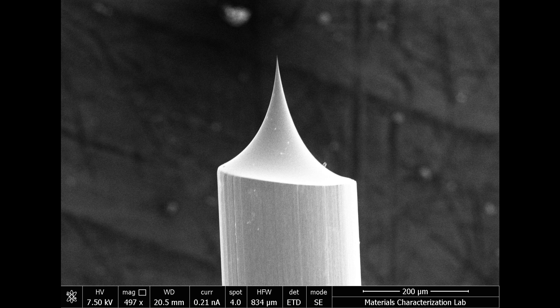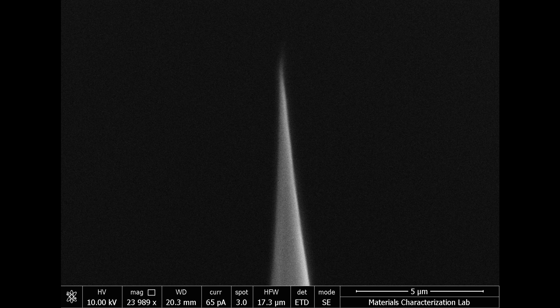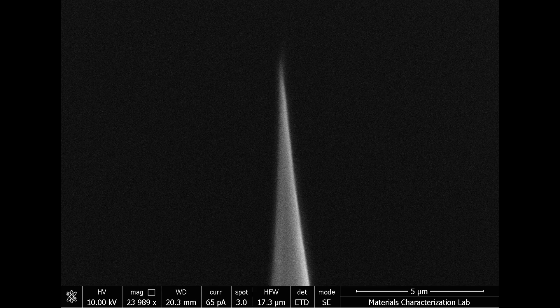I was not able to measure the radius of the tips due to the limitations of the SEM, but they appear to be less than 50 nanometers, which I consider to be good quality.